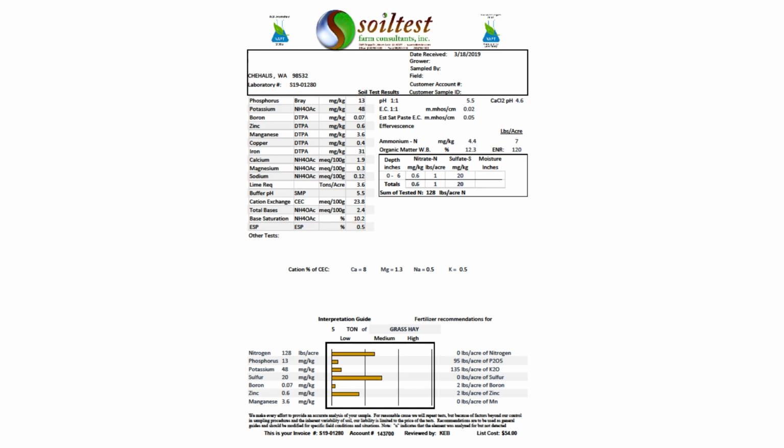Another thing to make mention of, the phosphorus in this sample was measured using the Bray method. In our laboratory, we use 4 different methods to determine phosphorus. On the previous 2 reports, you saw that phosphorus was measured as Olsen phosphorus. That's an extraction that uses sodium bicarbonate to extract phosphorus. In this sample, we use the Bray analysis, which uses hydrochloric acid and ammonium fluoride to extract P. Another extractant for phosphorus we use is Morgan, which uses sodium acetate as an extractant. And lastly, we use a Mehlich 3 extraction.